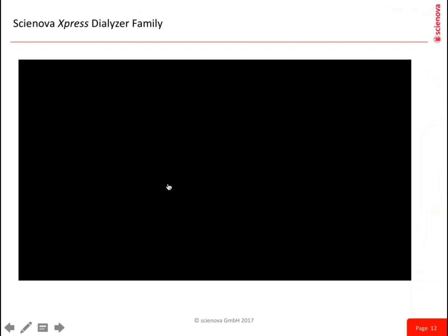Now I want to show a video where the usage of a microdialyzer is demonstrated.